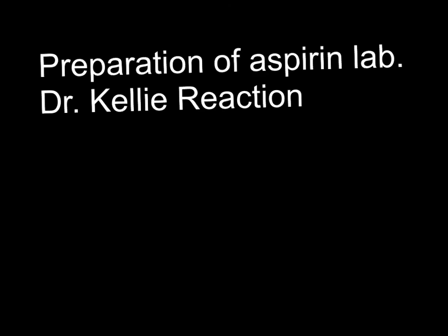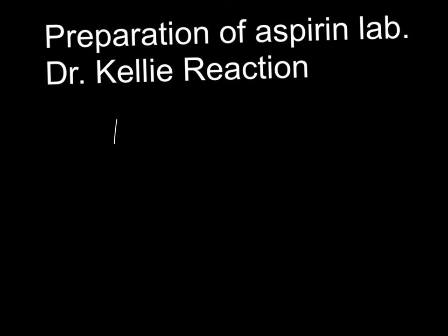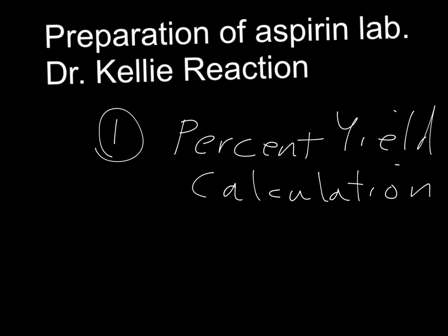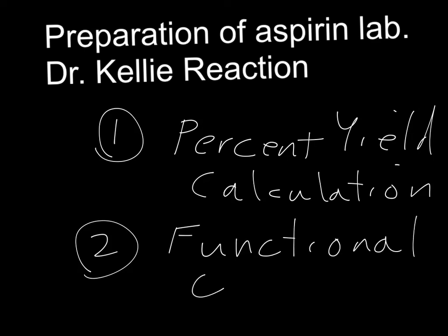All right. Welcome to the preparation of aspirin lab. This lab has two goals. The first of which is to teach you basic percent yield calculations. The second goal is to introduce you to functional groups. So let's get started.